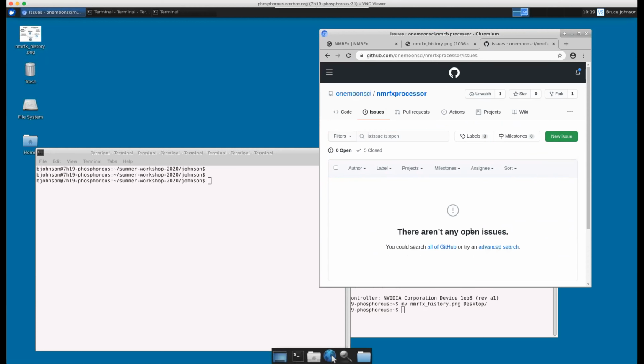Don't believe that there aren't any open issues. There are problems that we actually maintain inside at the Advanced Science Research Center at City University of New York, where I sit up in Harlem when there's not a COVID pandemic going on. We have our own tracking GitLab system there, but we sync that periodically to the external GitHub site.